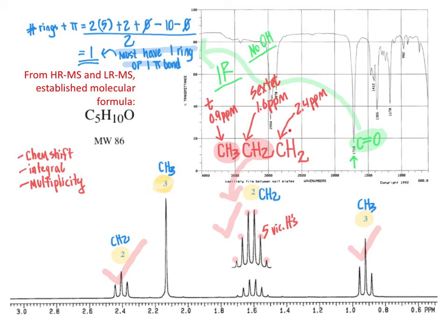So we come over to the next spot here. This CH2 group that we recognize by process of elimination as having to be the one at 2.4 ppm right here. That is a triplet. And in order for this CH2 group to show up as a triplet, that means that it needs to have 2 vicinal hydrogens because 2 plus 1 makes 3. And indeed, it already has the 2 vicinal hydrogens right here on this adjacent carbon. So therefore, with this CH2 group being adjacent to another CH2 group, it is a triplet.